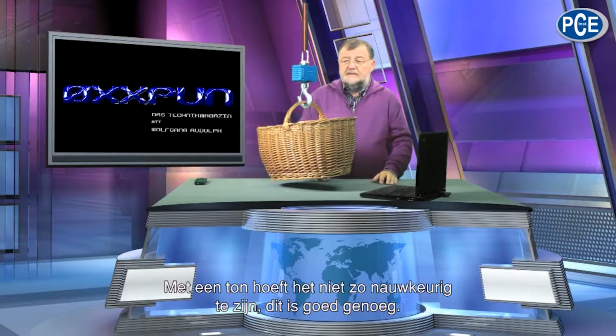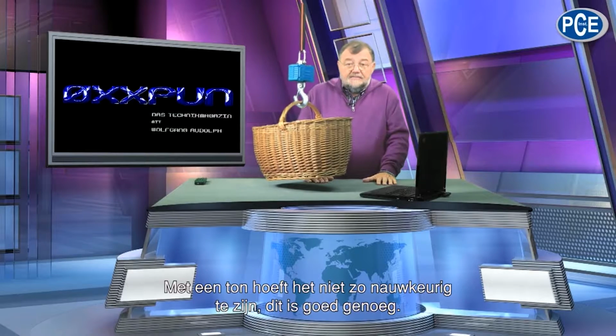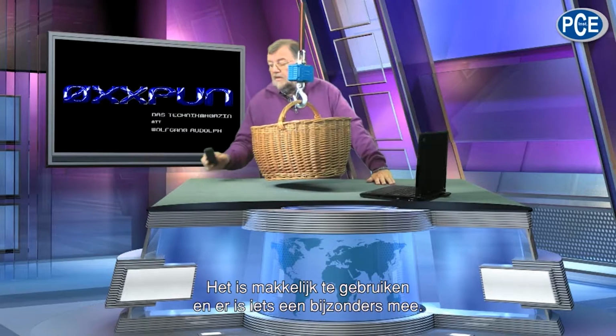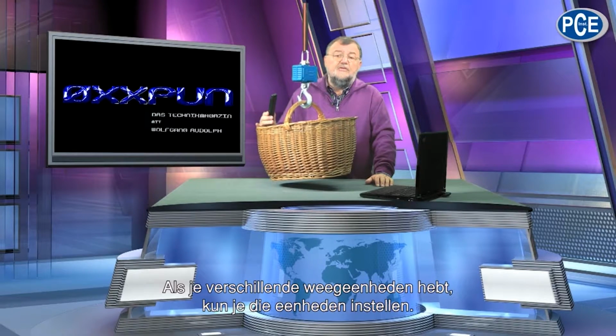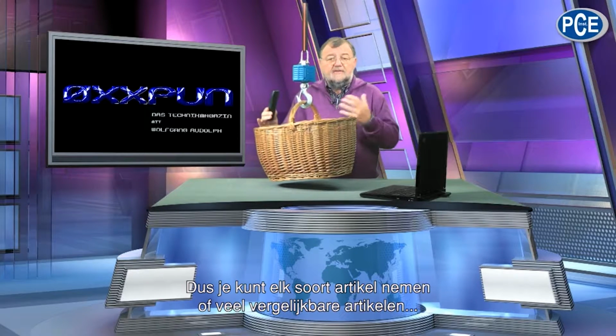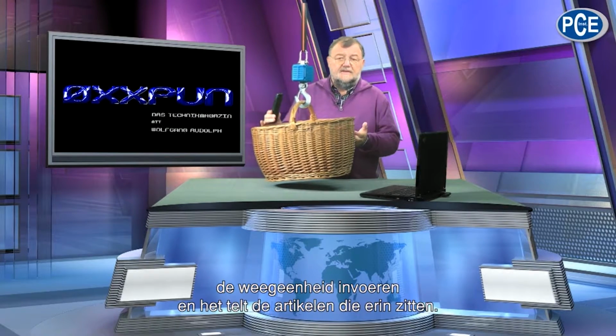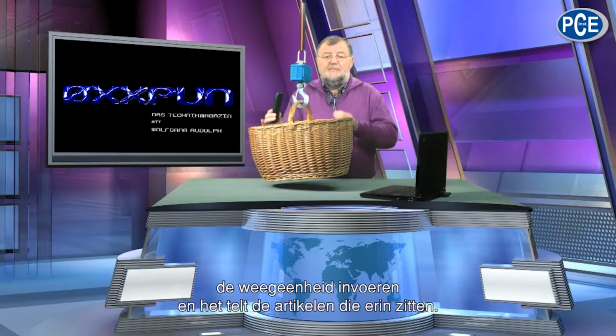It's clear with a ton you don't have to be so accurate. That's good enough. It is easy to use, and one feature, if you do have different measuring units, you can also set your unit so you could take any sort of item. If you have lots of similar items and put this measuring unit in it, then it counts the items you have in it.